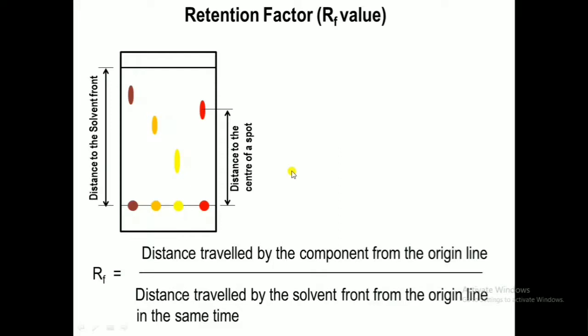So what is the importance of the retention factor? The retention factor is very important because if you conduct the chromatography in the same manner several times, the same compound will travel the same distance. So the RF factor is something like a characteristic of a compound.